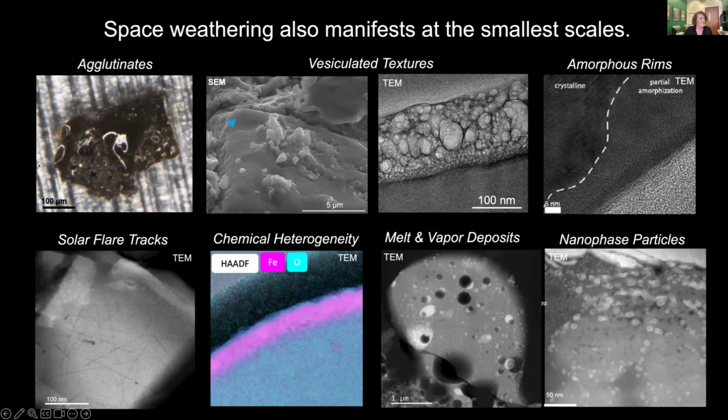First, we have the production of these grains called agglutinates. These are a result of those micrometeoroid hypervelocity impacts. You've got something coming in, it's melting material and welding together mineral fragments with this glassy impact glass as a result of those impact events. Now, this is just in the optical microscope. They started looking in the scanning electron microscope and the transmission electron microscope to see what features were going on at the nanoscale that could cause some of these changes in the optical characteristics.